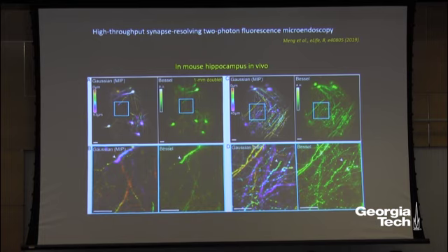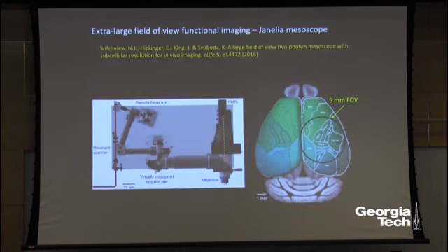So with these approaches working well together, you can really do very high lateral resolution imaging and high throughput imaging at the same time. More recently, we combined the Bessel imaging module with a microscope that was built by my former colleague, Karel Svoboda's lab, what they call a mesoscope.